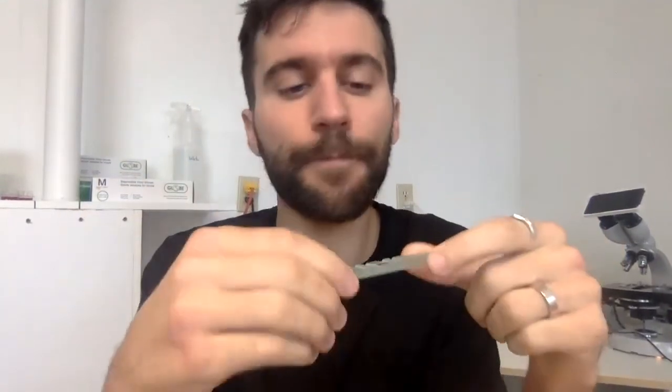The first problem we're going to see is that this yeast culture is too dense. There are too many cells per milliliter. If I just looked at it under the microscope, it would be millions of cells, and I can't count millions. That's just not possible. So the simple solution is a dilution. We'll take a small portion of this and dilute it to some reasonable density, and work our way back up to the original density at the end.